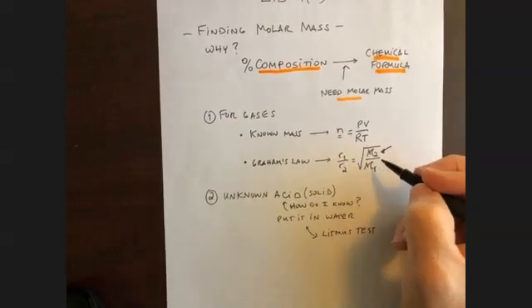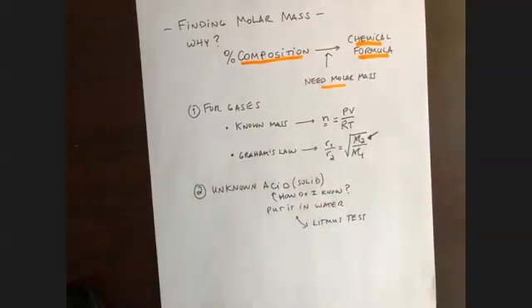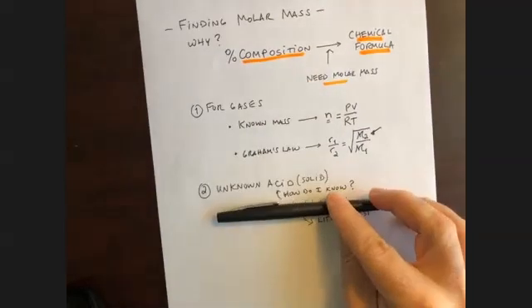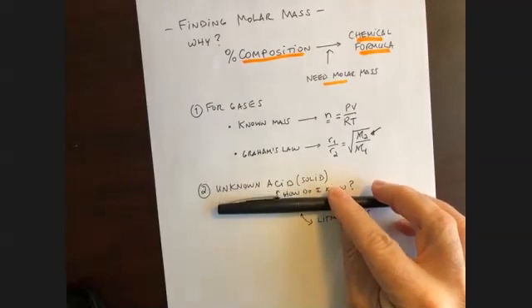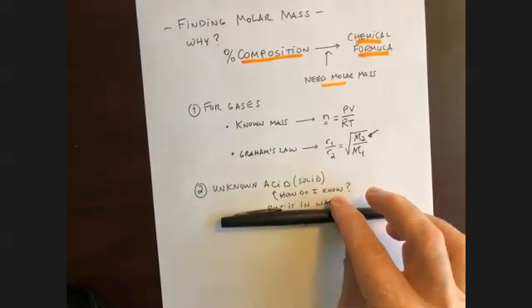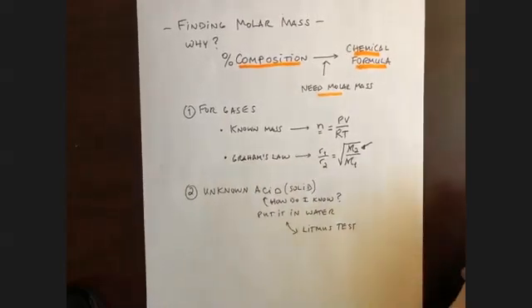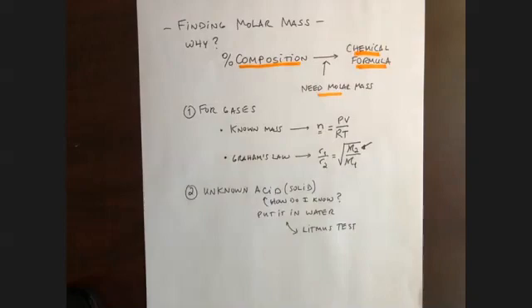In this experiment, we are going to be working with an unknown acid. And I asked the question here, let me block this a little bit. How do I know that it's an acid, right? Now, you already kind of peeked, but anyway, the idea would be you put it in water and you do a litmus paper test, right? And we know from our previous experience that an acid will turn blue litmus paper to a pink color, all right? So let's go and look at the typical process that happens when an acid reacts with a base.